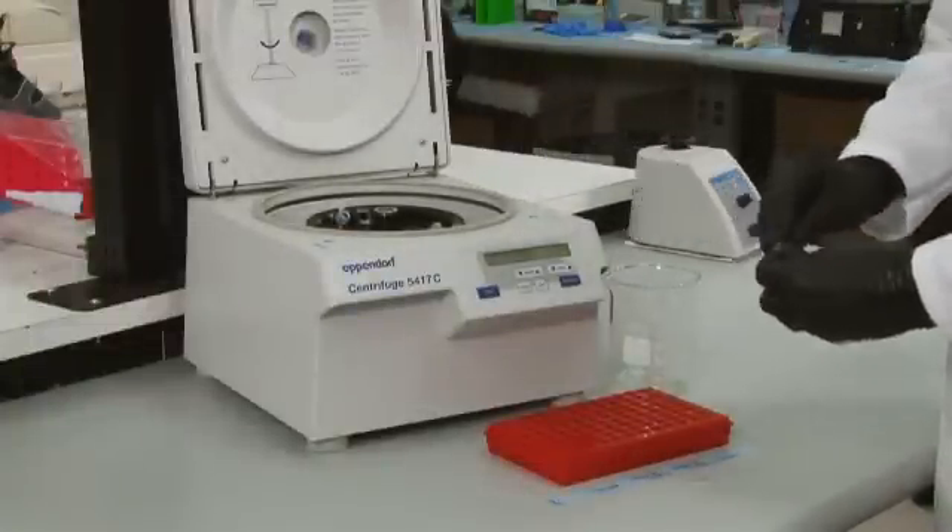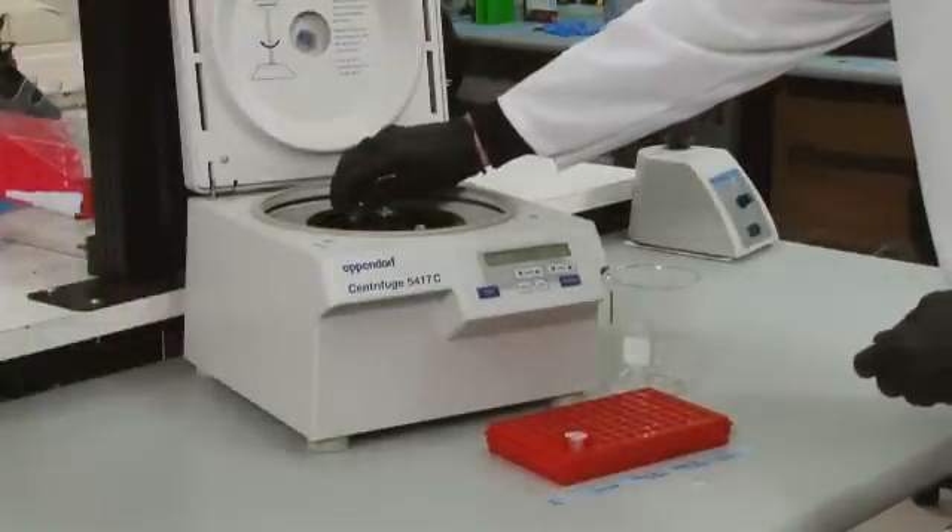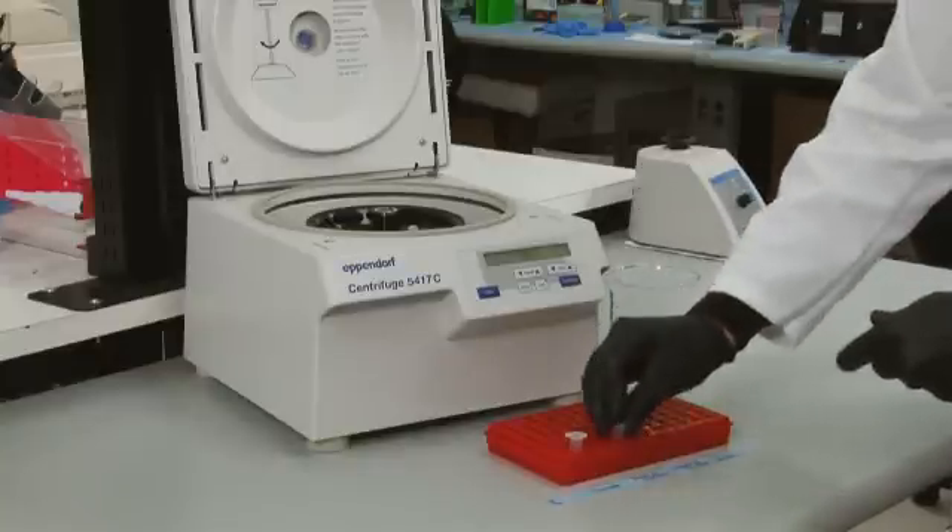Perform a final spin at 15,000 G for one minute. Discard the purification column and save the purified DNA at minus 20 degrees Celsius until ready for the last phase.